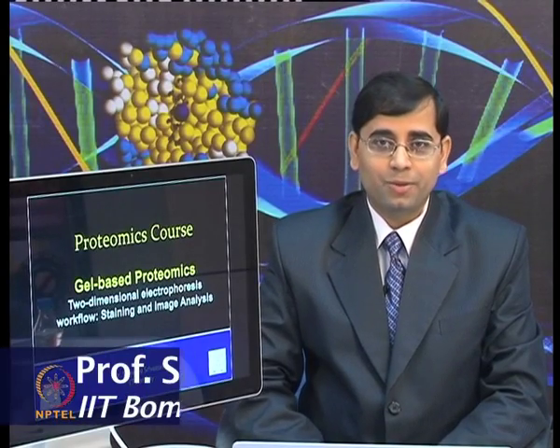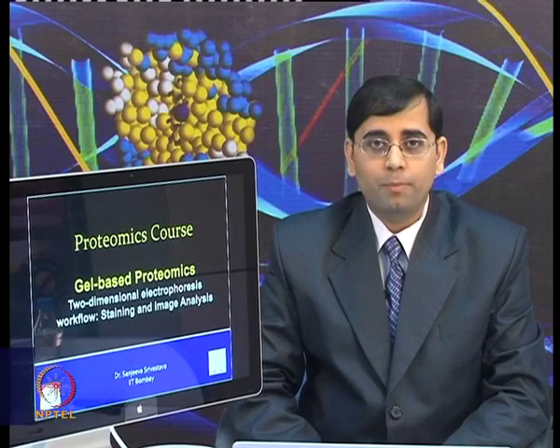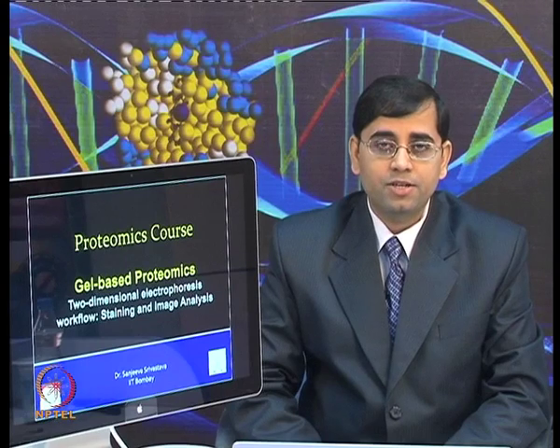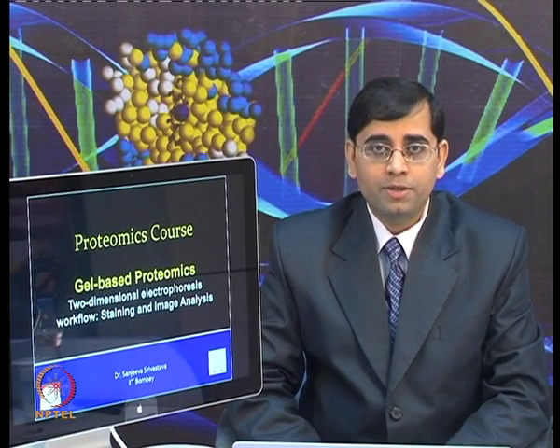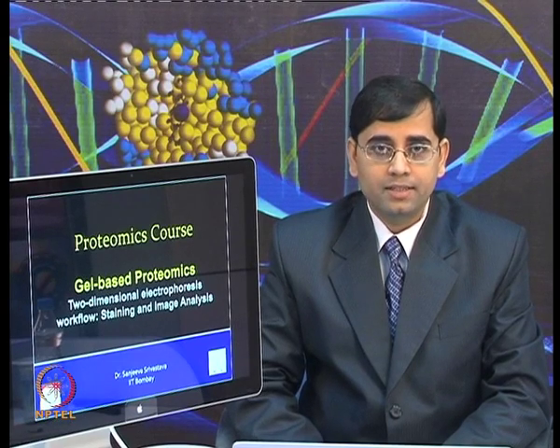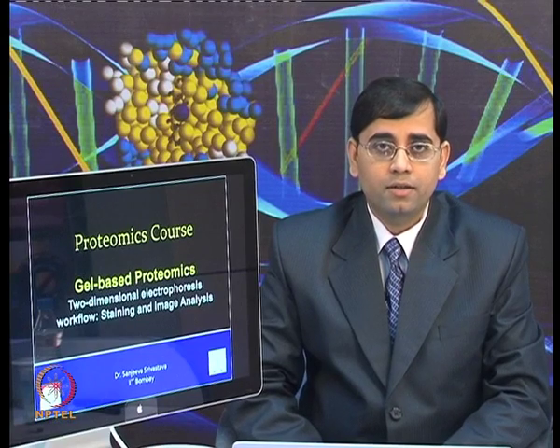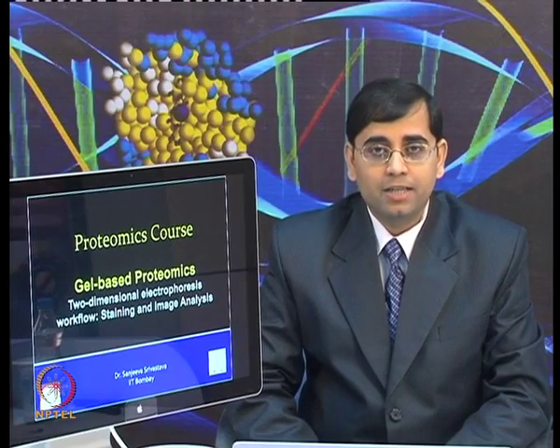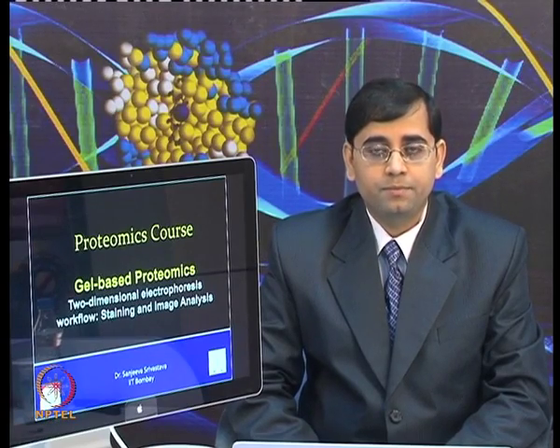So, welcome to the Proteomics course. In the last lecture, we started discussing gel based proteomics, how different techniques are used to separate complex protein mixtures. And I mentioned that SDS PAGE, blue native PAGE, two-dimensional electrophoresis and various advanced forms of gel based proteomics all together help to study different types of problems by applying gel based approaches in proteomics.